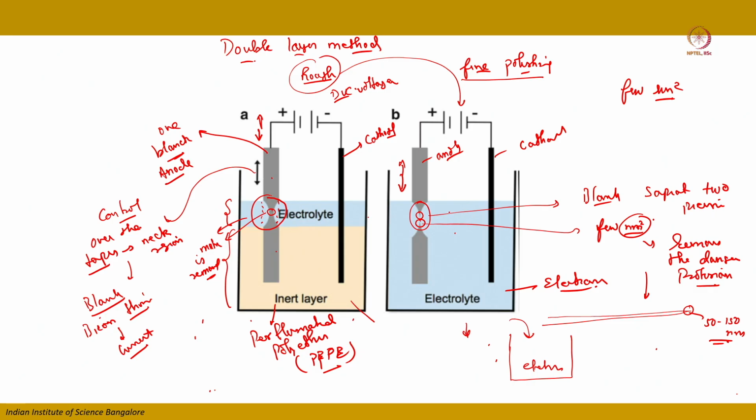Once this rough polishing is done, you will have a needle specimen with a few micrometer square area.